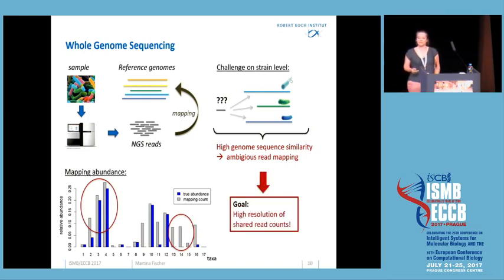So in order to achieve a high quantification accuracy on strain level, it is very important to tackle a fine resolution of shared read counts. So I want to emphasize that this problem here is really about read count resolution, and we do not necessarily need to know the exact origin of the read.